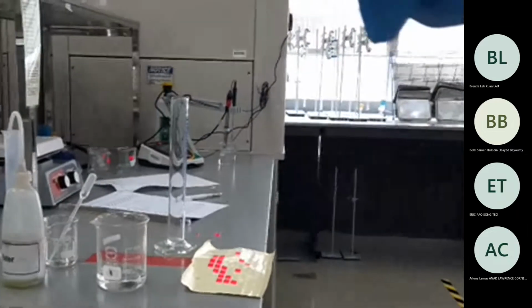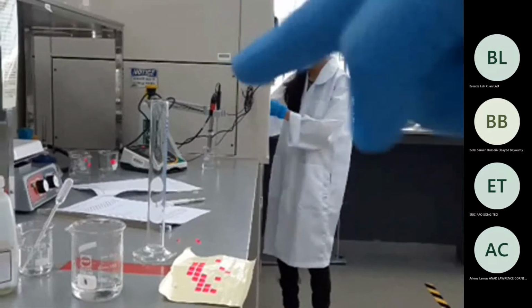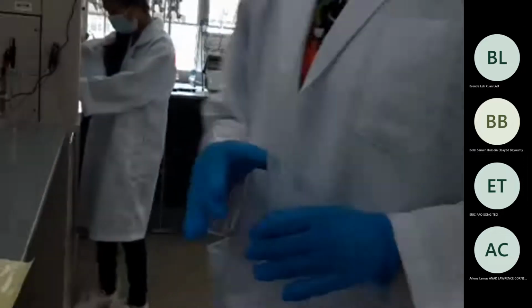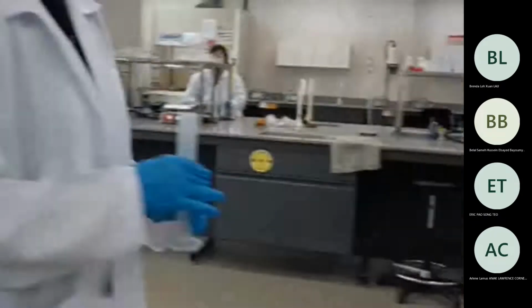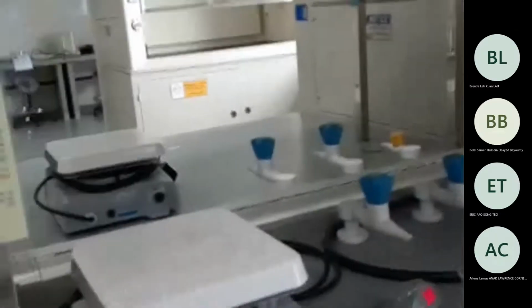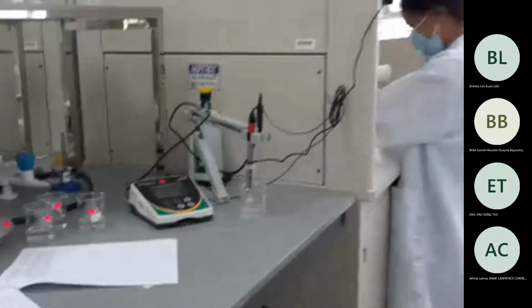You have taken already what? Sodium acetate. Okay, so that's it. Sorry, take the beaker also and go there. Sodium acetate. So you have to take now acetic acid. Ethanoic acid. Yeah, same thing. Ethanoic acid and acetic acid are the same thing. Go. Oh, okay. Take it.